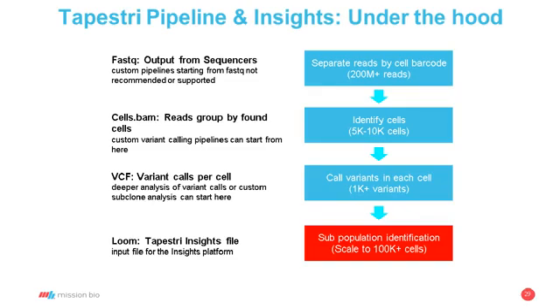So the Tapestry pipeline tool and the Tapestry Insights tool is a lot of where the bioinformatics analysis is taking place. Similar to what we did in Designer, a lot of the complexity is hidden behind these tools so that you don't have to deal with firing off runs and dealing with the pipelines, and you can really focus more on the analysis and the interpretation that's interesting to you biologically. So what's happening under the hood?